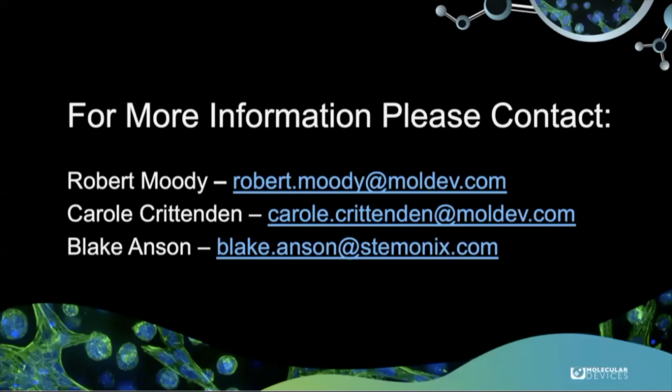And one more here. Quick too. Oh, please. Yeah, as far as getting ready for that AI, the Peak Pro 2 software coming off of Flipper and doing the analysis on the calcium oscillations is a module that we have that goes along with the software that runs the Flipper Penta. And that's where you're getting the peak heights, rates, peak widths, and that kind of stuff. Fantastic.